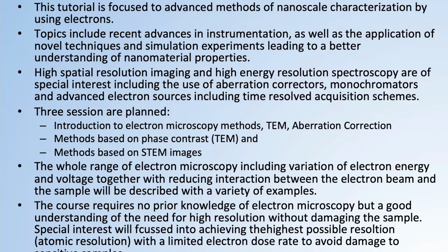We are planning 3 short sessions. One will be an introduction to electron microscopy, so that you don't have to have any prior knowledge of electron microscopy. The second part will be methods based on phase contrast, basically, transmission electron microscopy, and finally, but not least, methods based on scanning transmission electron microscopy.